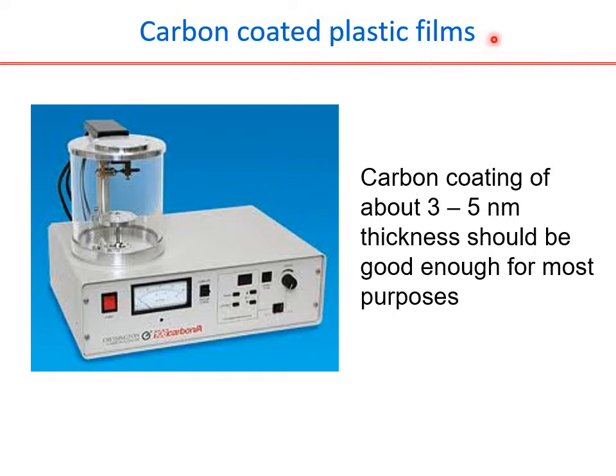One disadvantage of having the plastic film underneath the carbon coating is that it increases the thickness, thereby reducing the resolution. So that's a play between stability as well as resolution. We always just see the plus points and minus points of it. Now let's move on. Whether you like the plastic films or not, we are going to discuss how to make a carbon coating here.